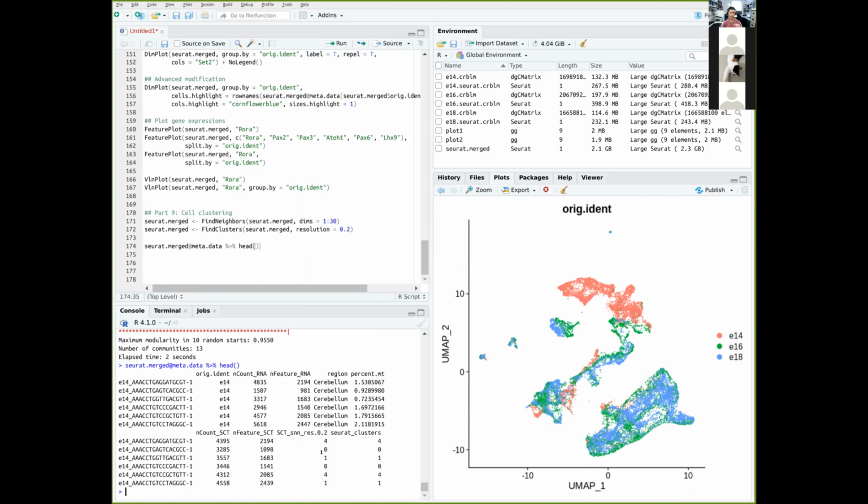And then it will also replicate this into another column called seurat_clusters. The reason why they did this is because they still want to retain the clustering identity depending on the parameter that you use. So if you change this to a resolution of 1, you will create another column with different values based on the resolution. But seurat_clusters will still be there because this is sort of like the assigned or default clusters that you have assigned. So it will create these two columns and also refresh or reset the identity of your cells to seurat_clusters. Let's try doing a DimPlot.